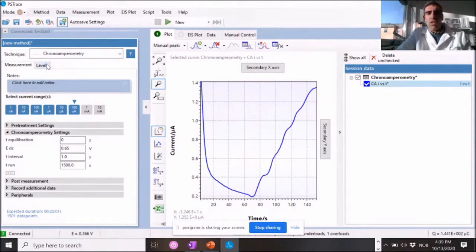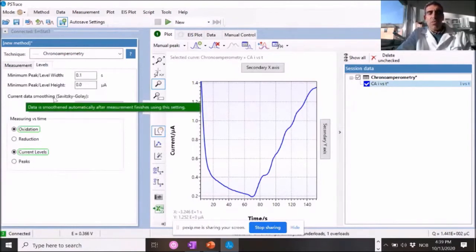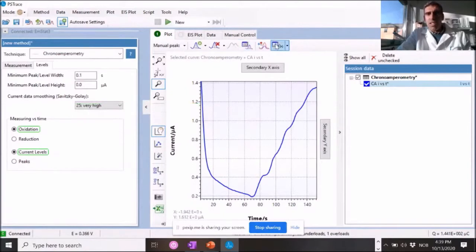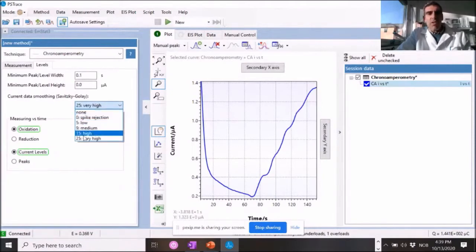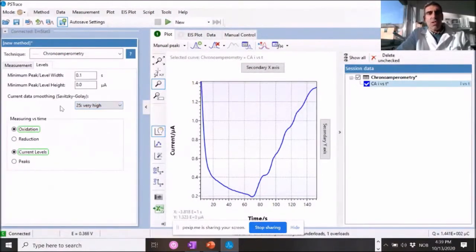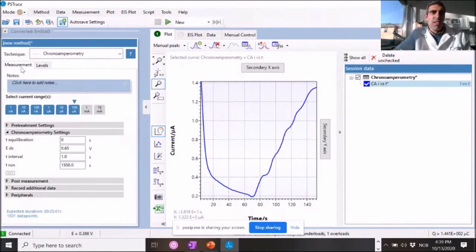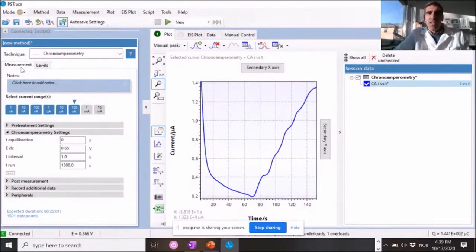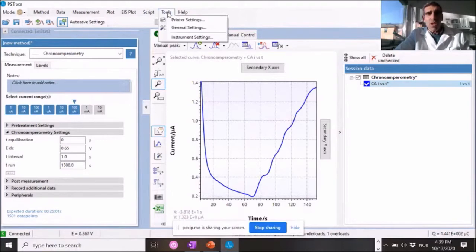I also do not add anything to the post measurement or peripherals or anything like that. One thing that you can do in order to apply a filter to your data and smooth a little bit your data is to do a data smoothing. You can do this afterwards in the curve calculations, in the curve operations. But normally I do from no spike rejection to 25 times, which basically gives a good, in case of any noise due to your setup or due to the steering, it gives you a smoother curve and allows you to see a little bit better the data, a little bit more pretty to watch.